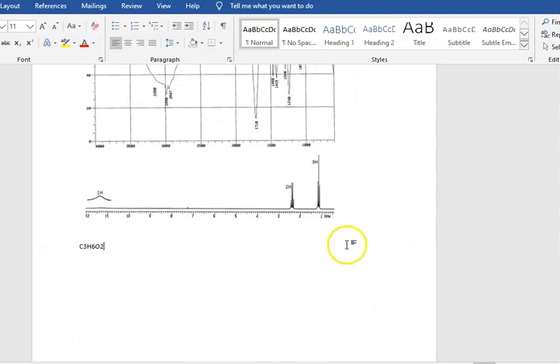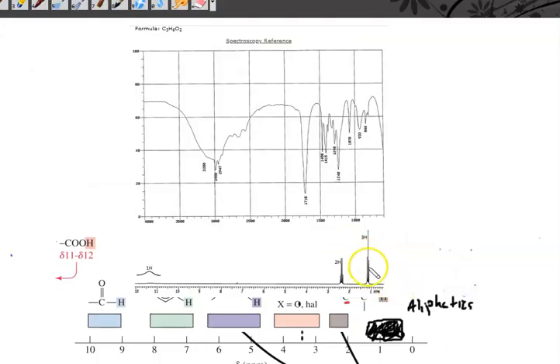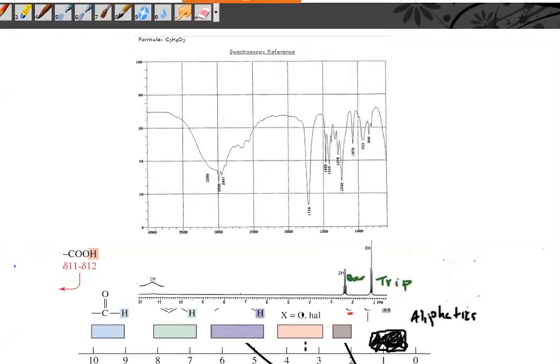So here, I guess you have to see everything, but I'll just tell you. I think you see it. This is a triplet, and this is a quartet. So let's write in a triplet, and this is a quartet. Can you even see that? Oh, is this on? Oh yeah, okay, good. This is a quartet. Just put a Q up here. Because I have one more that has more stuff to it.